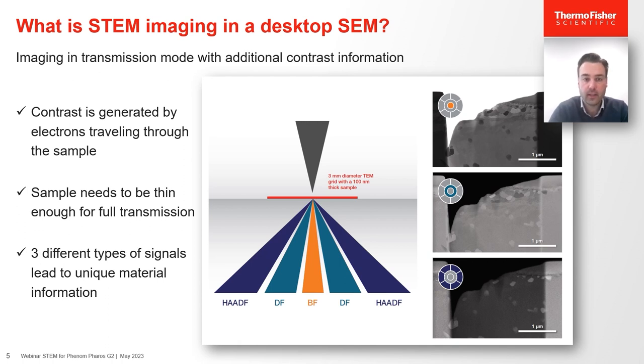The differences between these signals are nicely shown on an alumina lamella, as seen on the right-hand side, where the different grains can be clearly separated via transmission mode.